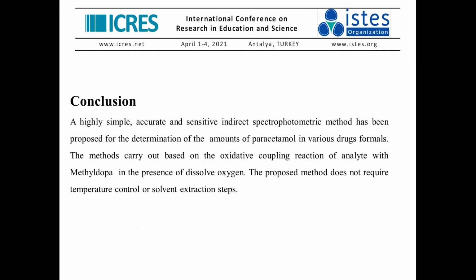In the conclusion, we developed a simple, accurate and sensitive indirect spectrophotometric method for determination of the amount of paracetamol in various drug formulas.